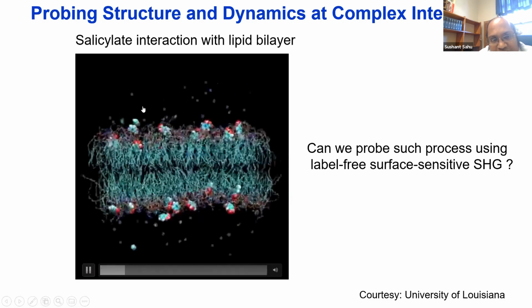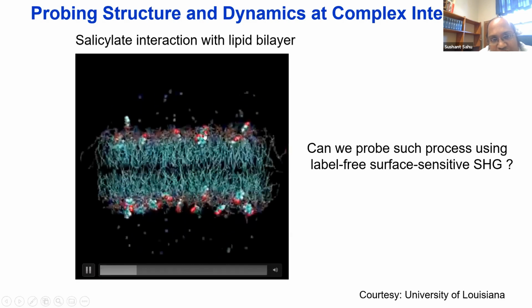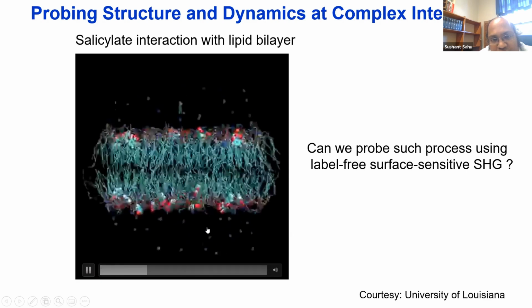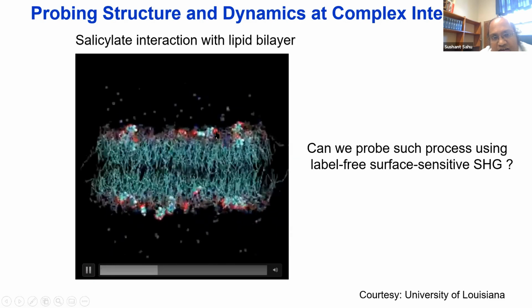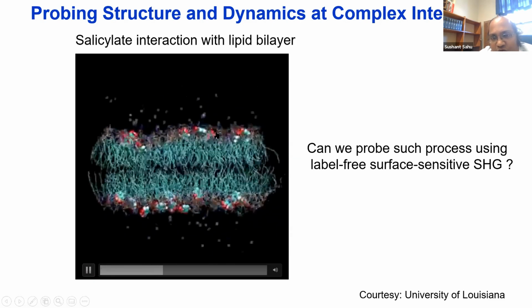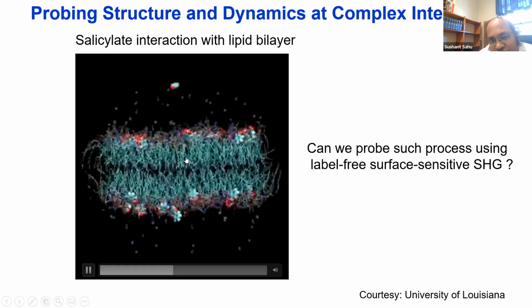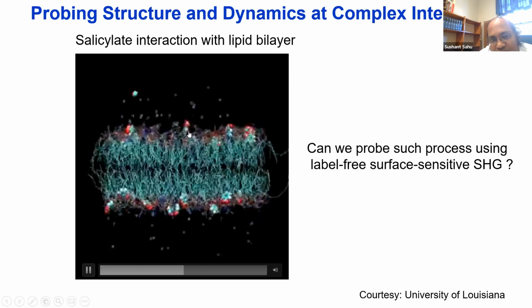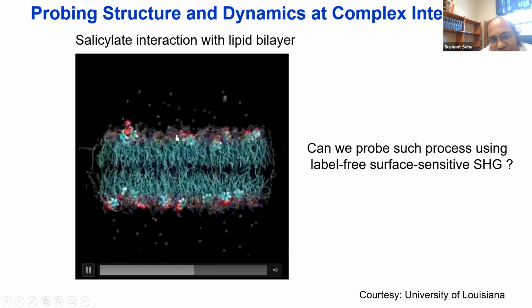And you can see that they're moving around across the outer plasma membrane, if you consider this, and this is the inner plasma membrane. And you can see that with time, there is an equilibrium where the adsorbed molecules on the outer membrane and inner membrane basically become equal. Okay, you can see right here.